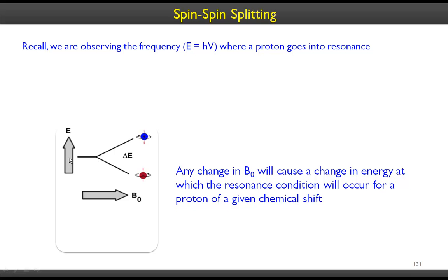This is the direction of the external magnetic field. Let's imagine that this has the applied field B naught. In the absence of any other factors, this nucleus has 2 spin states. Either it's aligning with the magnetic field, and this is the orientation of the local magnetic field generated by the spinning nucleus, and as a result, this is at a lower energy state compared to this opposing magnetic field generated by the spinning nucleus. This is probably -half, and this is +half of the spin states if it is hydrogen. We are in hydrogen NMR, right?